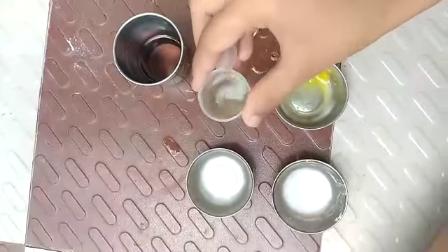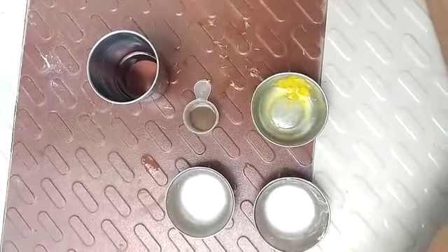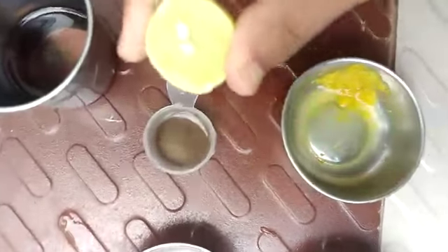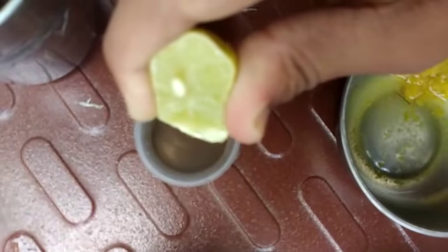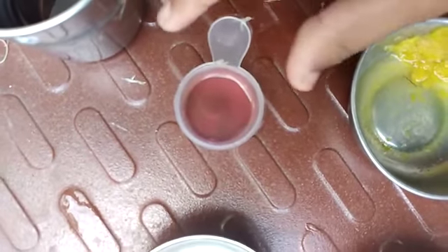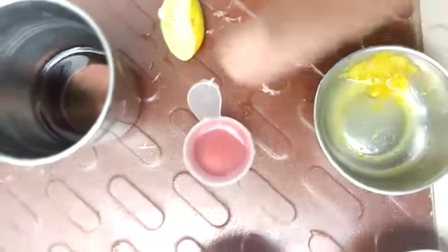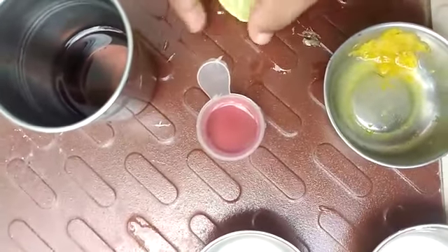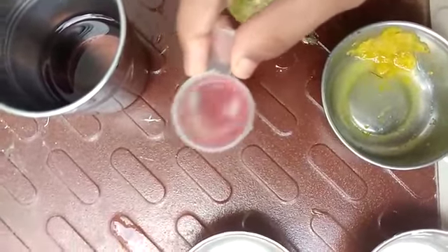This is some solution in the beaker — the indicator. Now we are going to put lemon juice. See, it has changed to red. It shows that lemon is an acid — it has acid in it. So lemon and lemon juice is acidic.